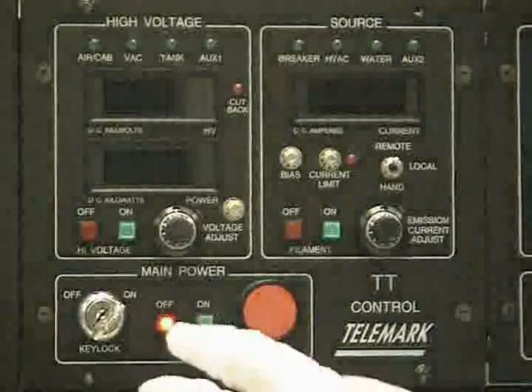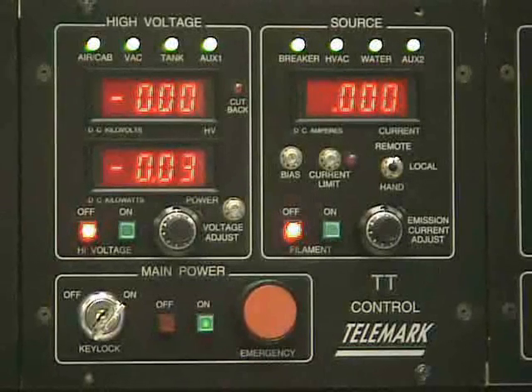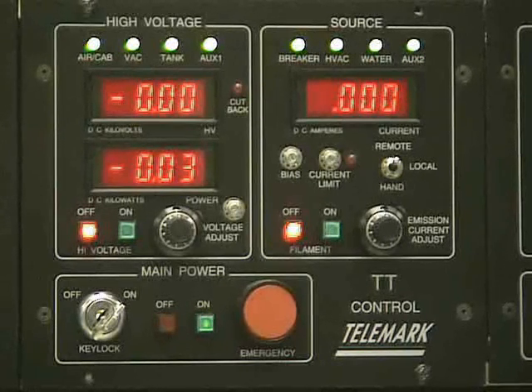Turn the key lock on the electric beam controller to on and press the green on button next to it. Before proceeding you must wait for the power supply's cooling fans to reach operating speed. This will take about a minute. The power supply will make a clicking noise indicating that it is ready.